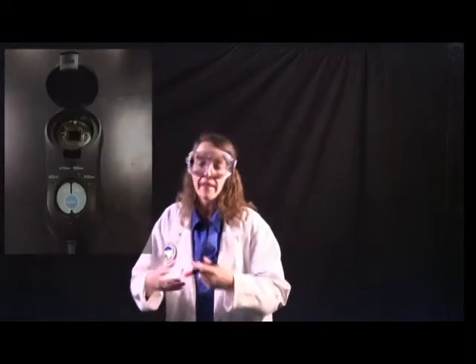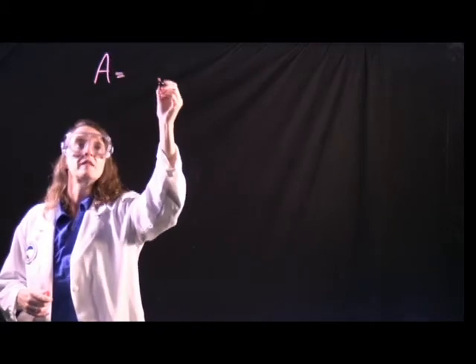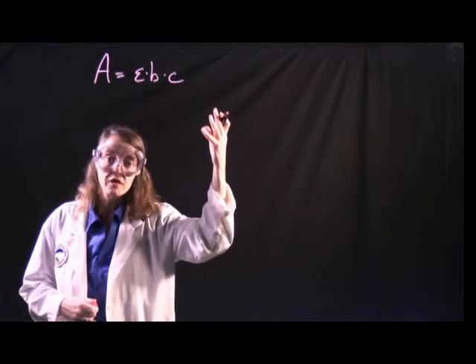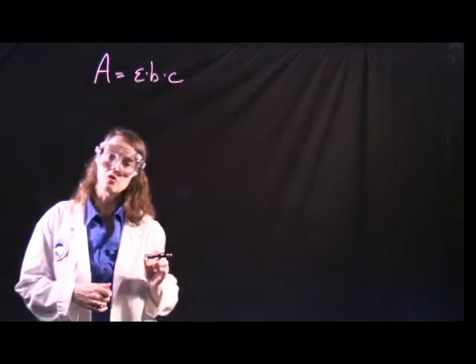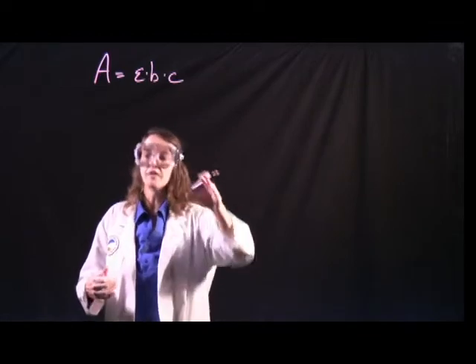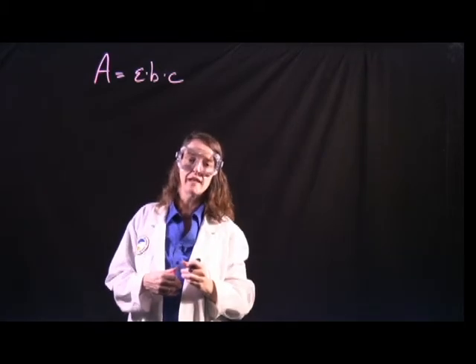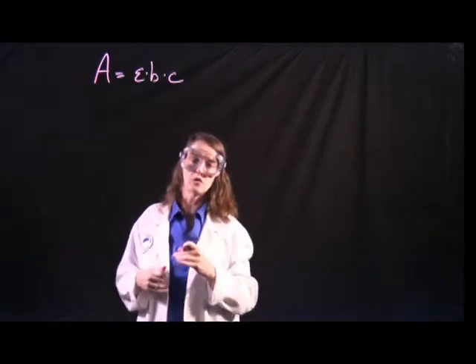So we can watch the fading of this violet color colorimetrically in a little colorimeter, where we have the relationship between the absorbance of light is equal to some constants times C, which is the concentration in molarity. So the amount of light absorbed is related to the concentration. And so we can gather information about this compound. We can look at what concentration of crystal violet we have at different periods of time, and we'll use the LabQuest colorimeter to collect all of these data points, and then we'll be able to graph them to determine whether the reaction is zero, first, or second order.